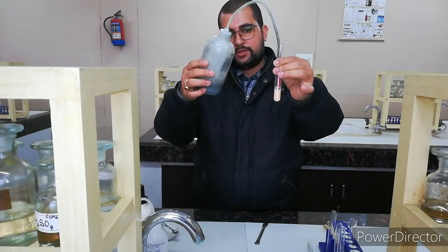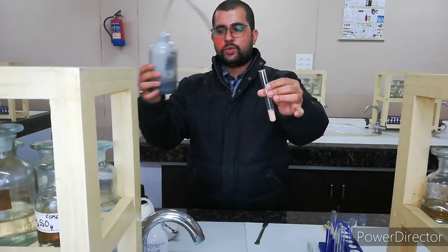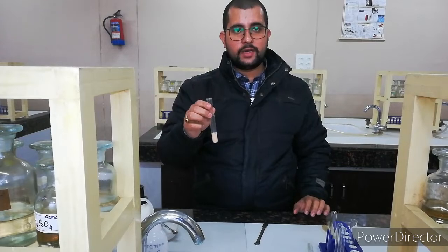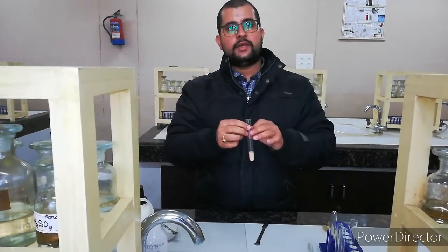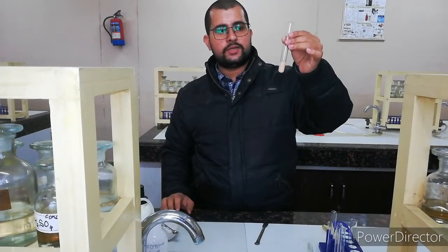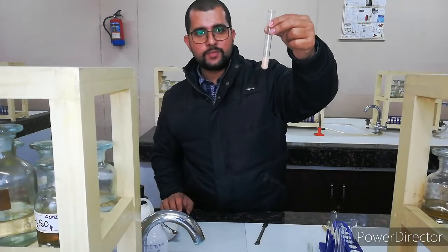The pinkish creamy color is appearing here, indicating that manganese may be present, because in group 4, if you add H2S gas and a black precipitate comes, then cobalt and nickel are indicated. If pink comes, then manganese is supposed to be present. Or if buff white or off white comes, then zinc will be present. So it is not white, it is appearing as a light pink or buff pink color. So we can conclude that manganese may be present here.